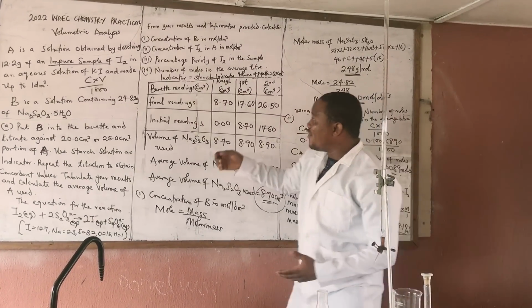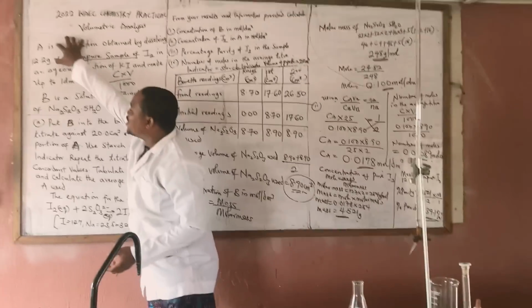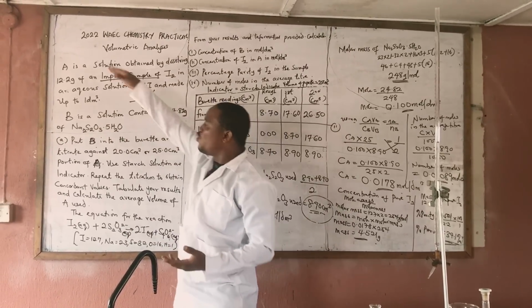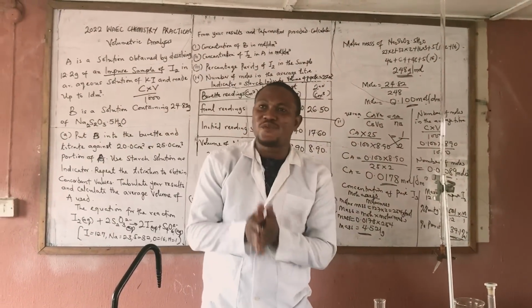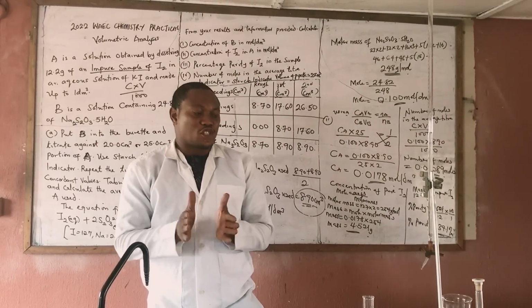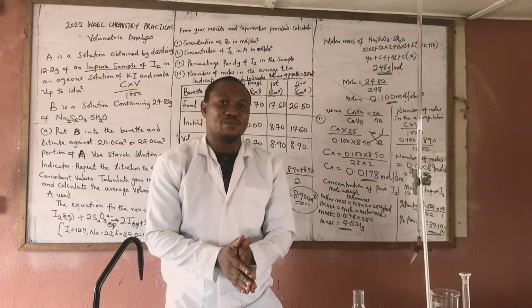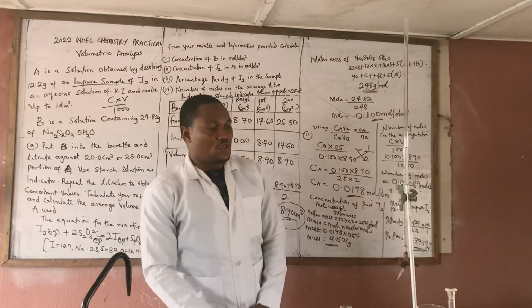If you are giving this, and that's the reason why I said sometimes they'll give you all the information for this, you look for this, it's still the same thing. Sometimes they give you the information for this, you look for this, you are still saying the same thing. So just watch this video carefully and adhere to the instruction on that day. Very, very important. Not the one they ask you to put in the burette, not the one they ask you to put in the pipette, and do justice to those questions.